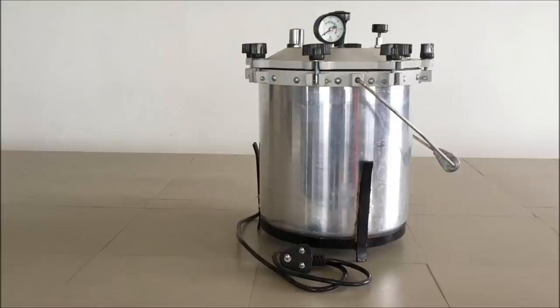It is very much similar from the construction point of view with the normal household pressure cooker. The principle of autoclave is by applying the pressure and destruction of cell wall of microorganism as well as coagulating the protein inside it. So let's see the parts of autoclave.